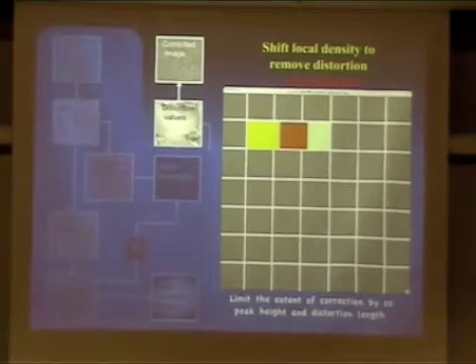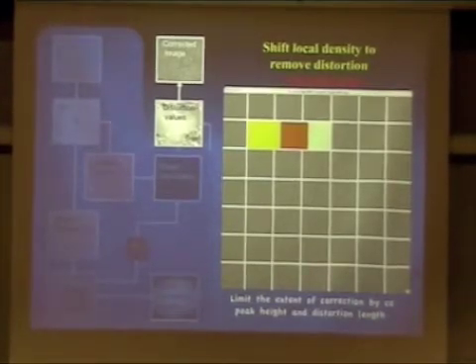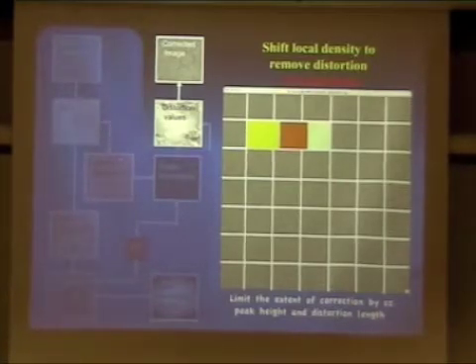If you do this too much, you are going to create an artifact. This is one of the reasons that when we do several rounds of unbending, you always unbend the original, not your previous rounds of unbending the image.